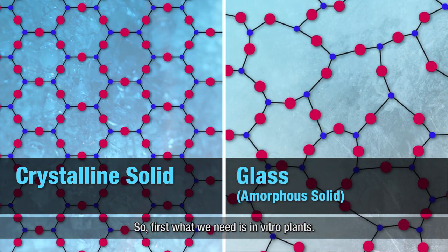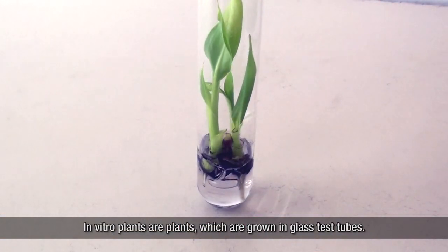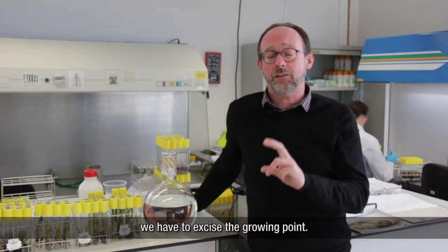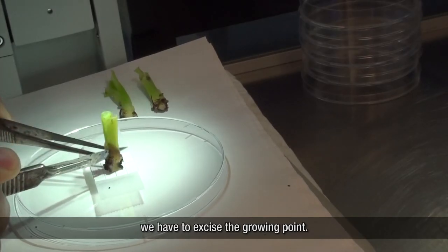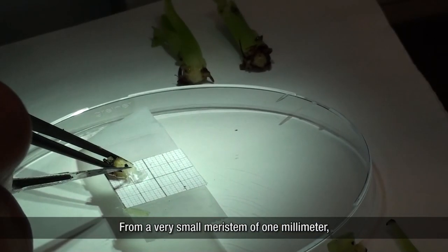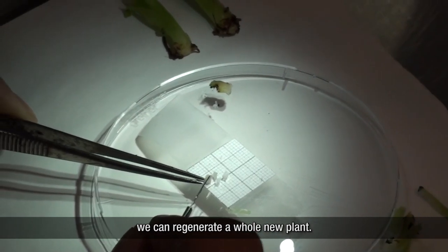First, what we need is in vitro plants — plants which are grown in glass test tubes. From these in vitro plants we have to excise the growing point, what we call scientifically the meristem. From a very small meristem of one millimeter we can regenerate a whole new plant.